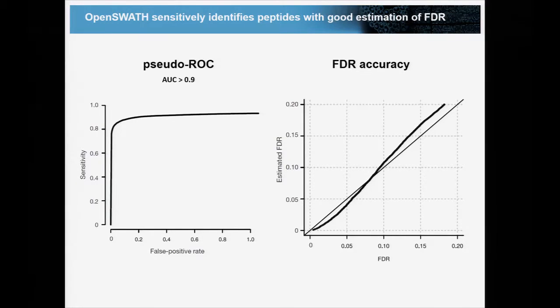So here's the result of that comparison. This is a receiver operator characteristic curve. Sensitivity means: when the manual analysis said there was a peak, how often could the software also detect that peak? And what they get up to is about 90%.